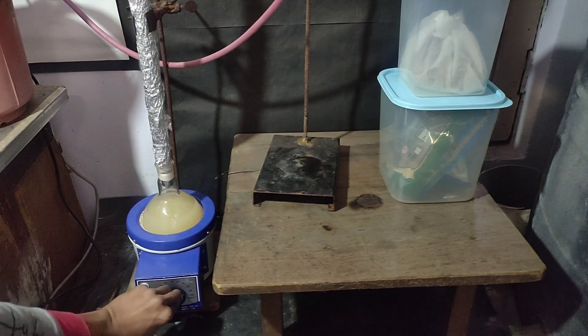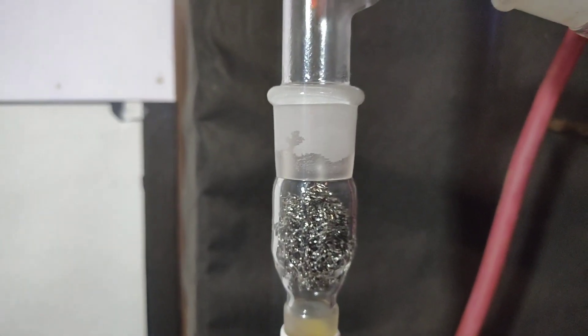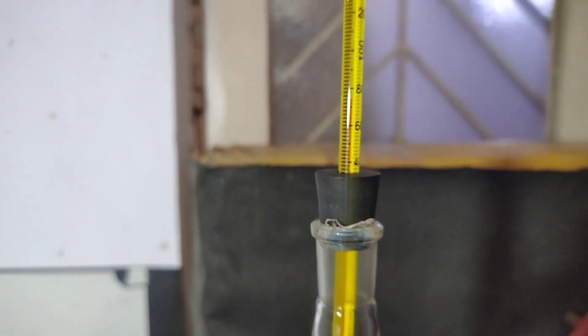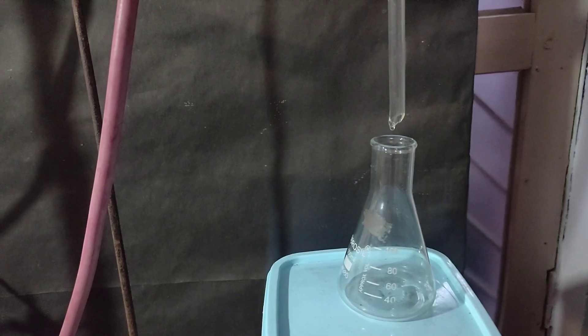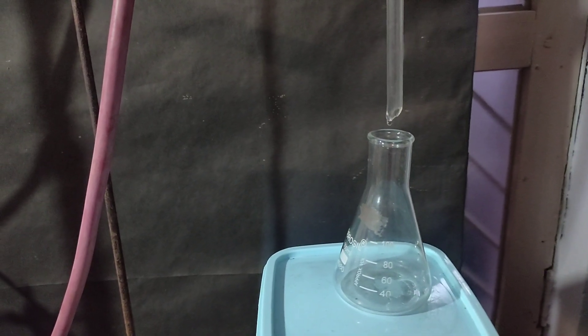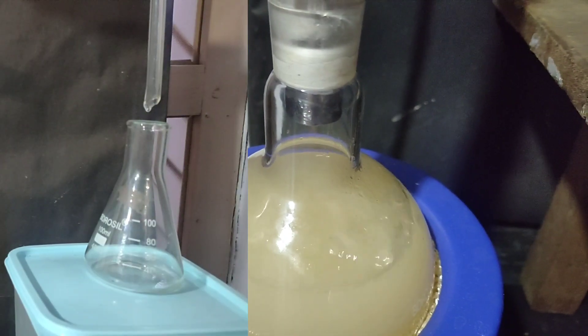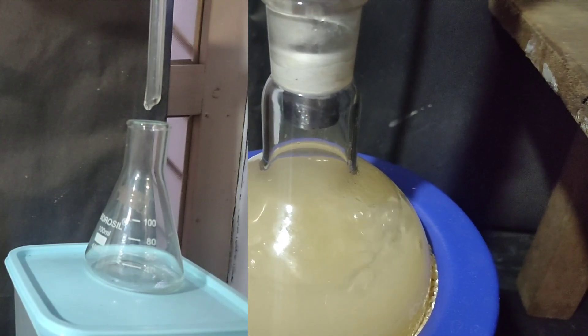I switched on the heating mantle and now vapour has reached the top of the column and the temperature has started to rise in the thermometer. My thermometer has an error of minus 2 degrees Celsius. So instead of 78 degrees Celsius, I started getting distillate at 76 degrees Celsius. At this moment, the heating mantle was set to 30 so as to not let the temperature rise above 78 degrees Celsius in the still head.